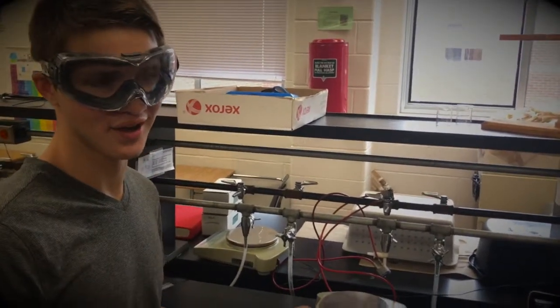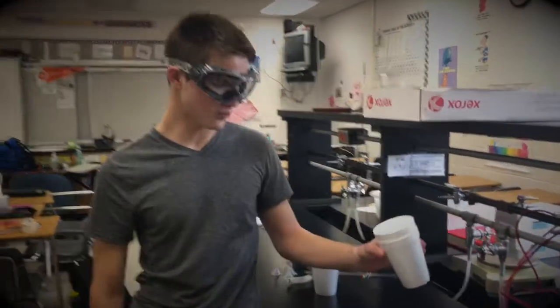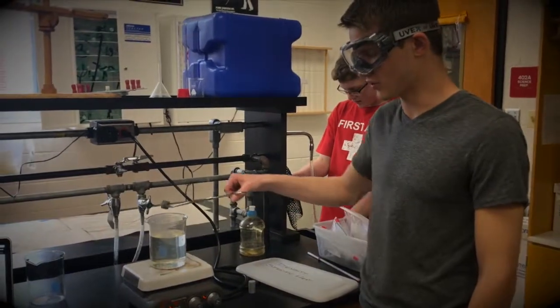Record the mass of both empty foam cups. Record the mass of foam cups with water. Add both metals to boiling water.